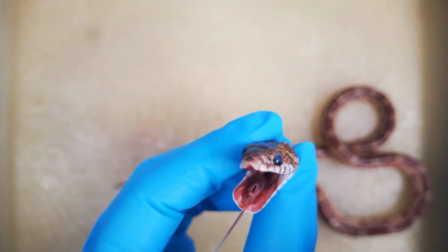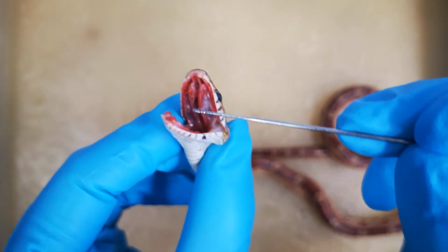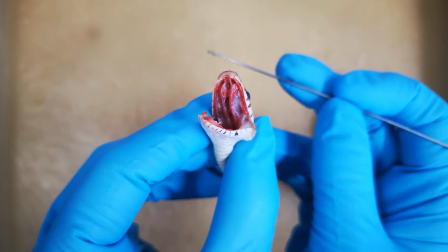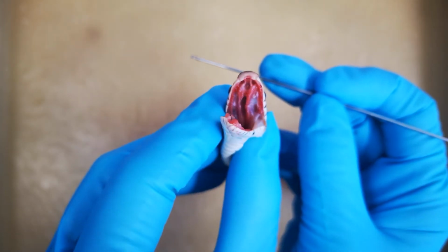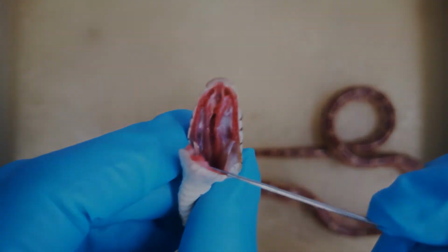In most snakes, the two lower jaws are not strongly connected anteriorly, giving a great deal of mobility. In the mouth of the snake, we can see the large opening of the trachea. In the roof of the mouth, we can see that Pantherophis guttatus has two rows of teeth. The outer row is on the maxilla, the inner row on the palatines.